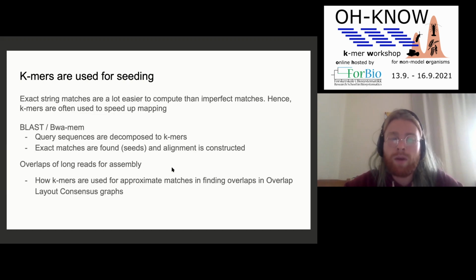It's completely incomputable. And again, for overlaps of long reads, Kmers are used to decide which of the reads are neighboring. This was especially useful at the very early stages of long read technologies, when the reads were extremely noisy and the mapping was really expensive. The first assemblers were using this, because decomposing to very short Kmers would be impractical. So they were trying to assemble the reads directly, but searching which reads are neighboring was expensive, and basically using Kmers was a big step forward.